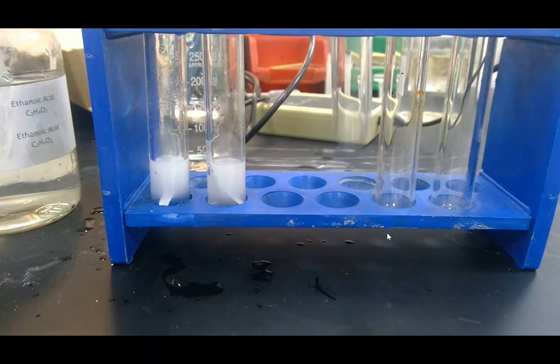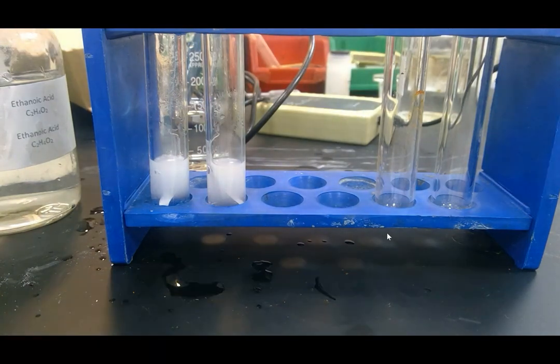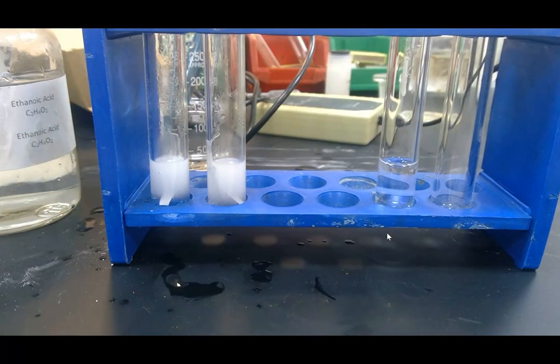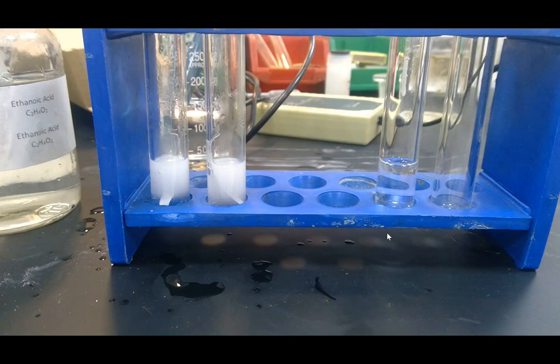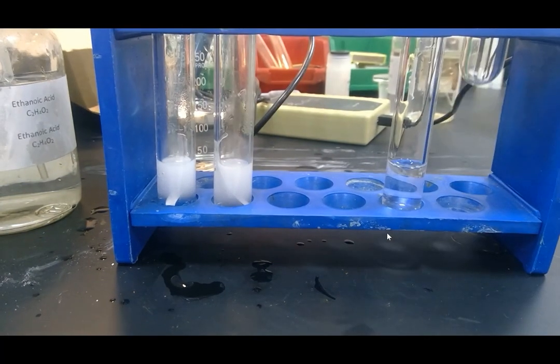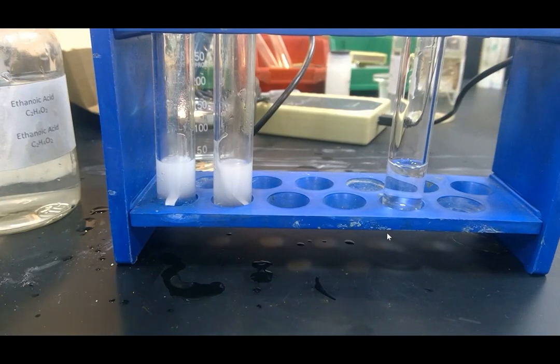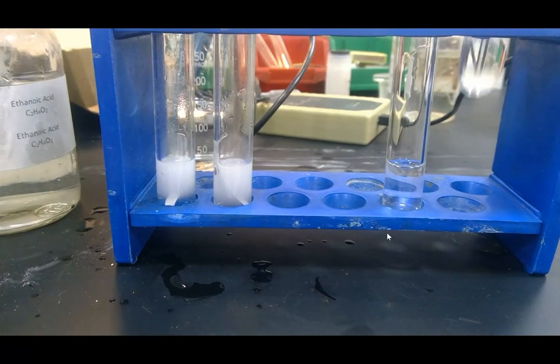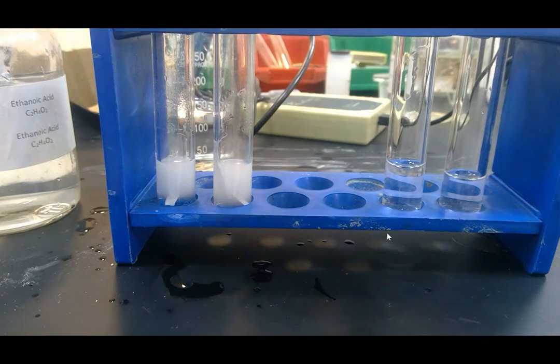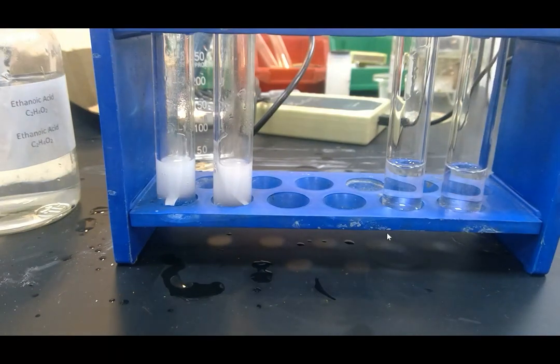So again, on the left-hand side, I've got my hydrochloric acid. Hydrochloric acid is on the left in both reactions. And on the right, I've got my ethanoic. Again, try and make sure that the amounts in there are approximately equal.